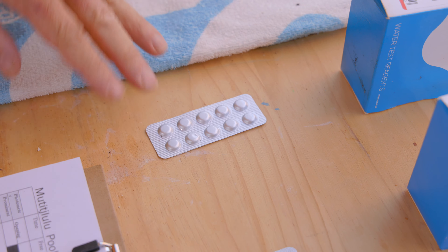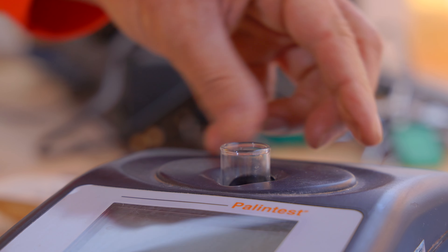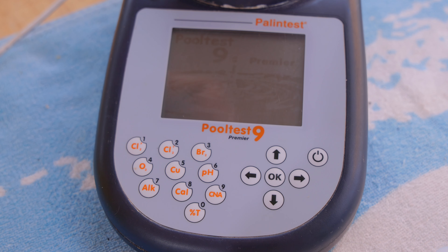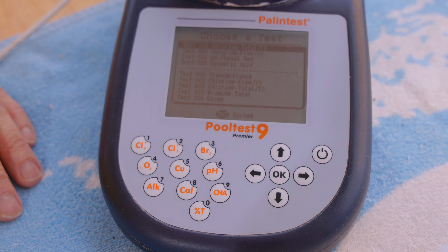The first thing we need to do is get our water sample. We'll be making a video on how to collect the water sample as well in this series. So first step: take our syringe, take some water, and then we fill the test tube up to this line here.